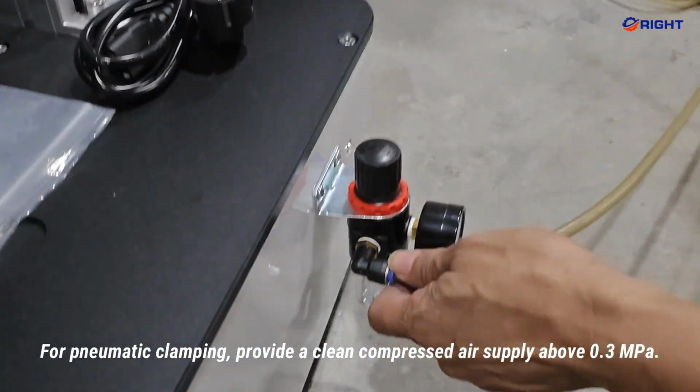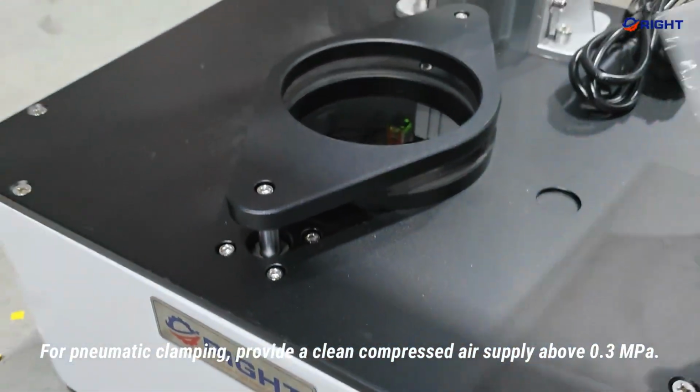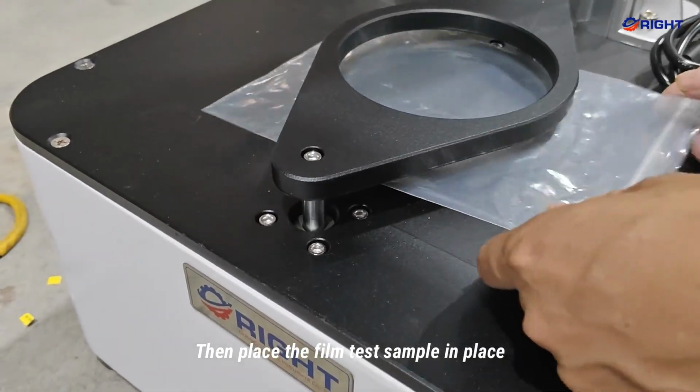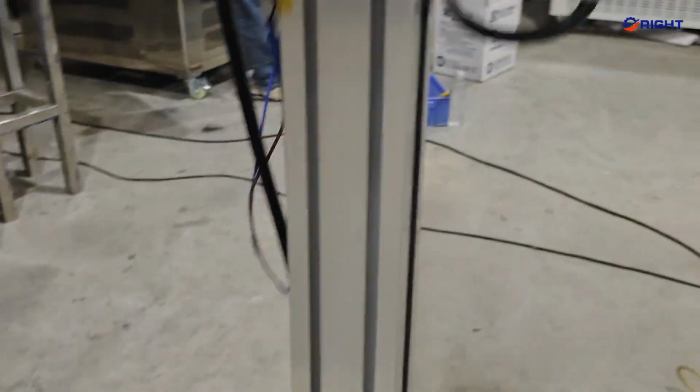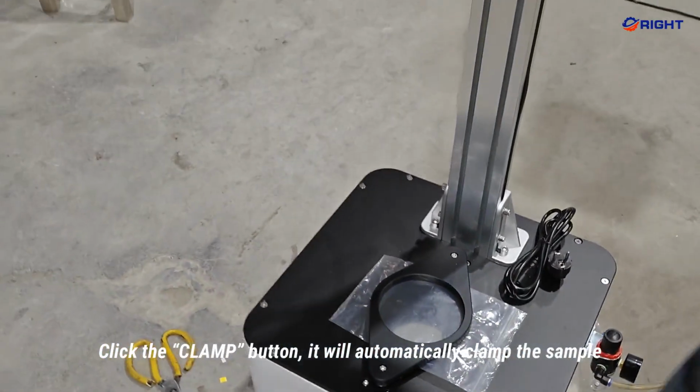For pneumatic clamping, provide a clean compressed air supply above 0.3 MPa. Then place the film test sample in place. Click the Clamp button, and it will automatically clamp the sample.